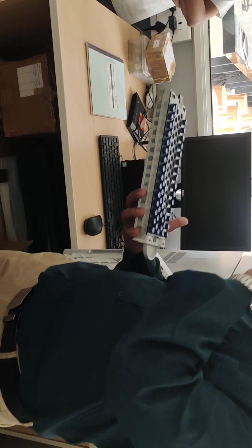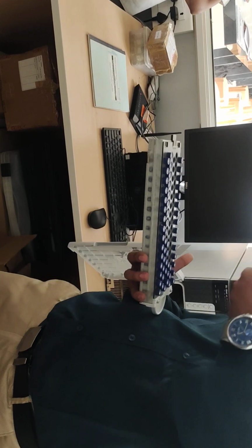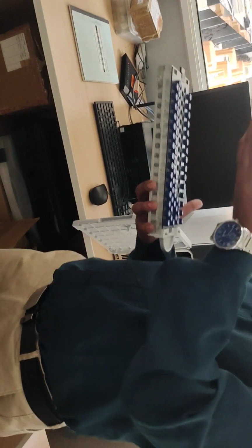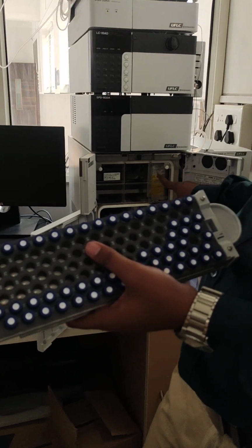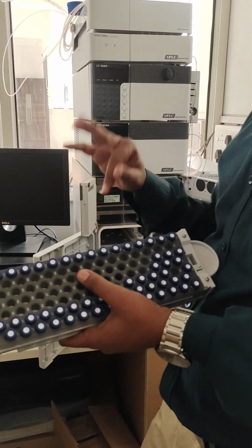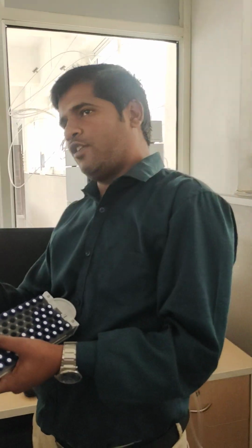Which mechanism do we have? Autosampler. Autosampler means the injector will automatically take the sample from this sample cell and provide it into the column. That is the role. Then the autosampler is available here. Just check this steel apparatus, this steel body is an autosampler, or we can call it an auto injector. What is the name? Autosampler or auto injector.